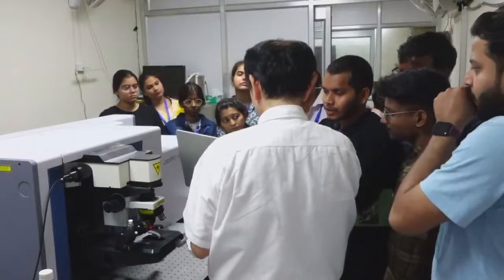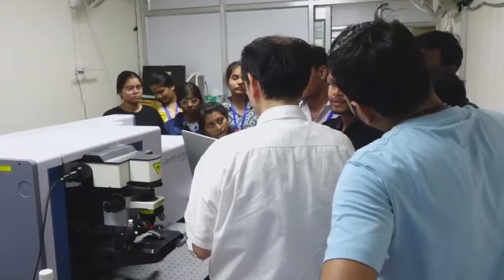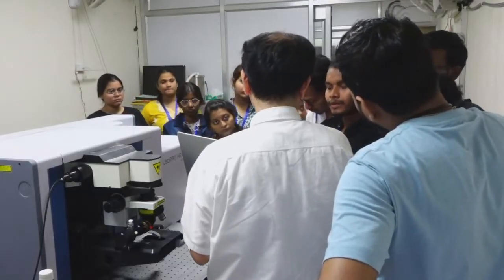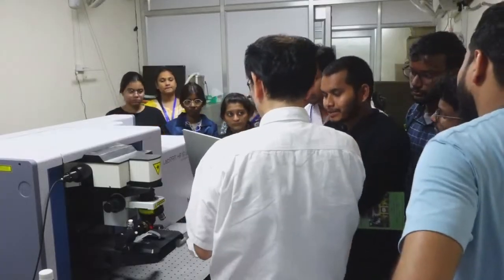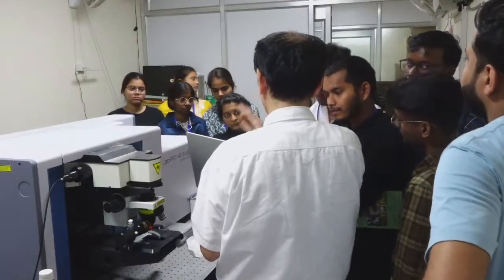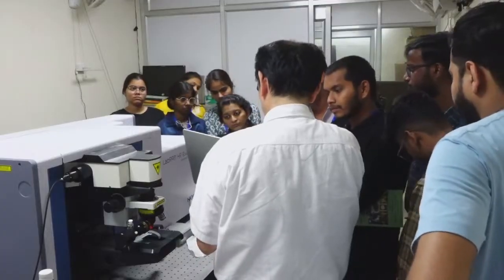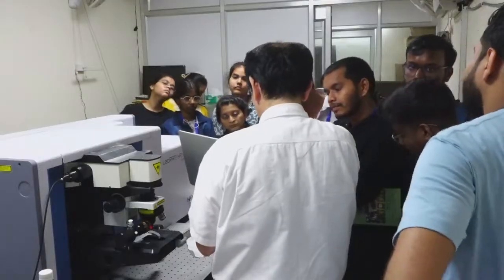So if a solution contains two or more compounds, how can we distinguish? Compare with the model spectrum. Prepare the model spectrum in the solution for several model compounds, list all the spectra and compare.